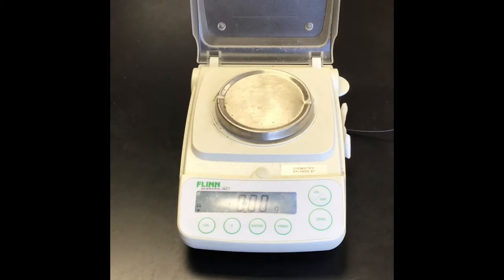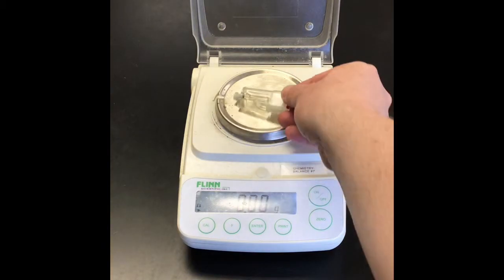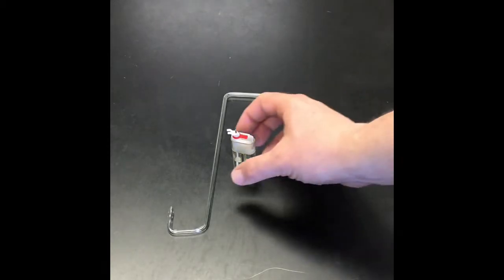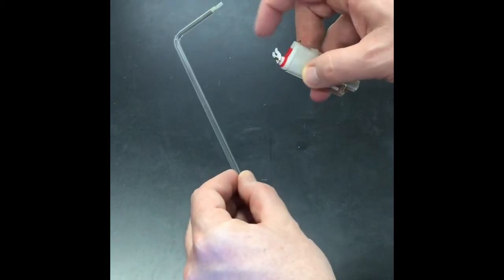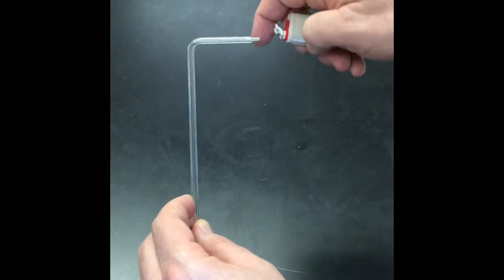So in the first step, you're going to take the butane lighter cartridge and find the mass of this before, so we have an idea of how much butane there is to start. So you would record that value. Then once you have massed the butane cartridge, you want to take this little metal nozzle here, which is what you're going to attach to the J tube. Now this white handle here, you don't want to press that because that's what releases the gas.